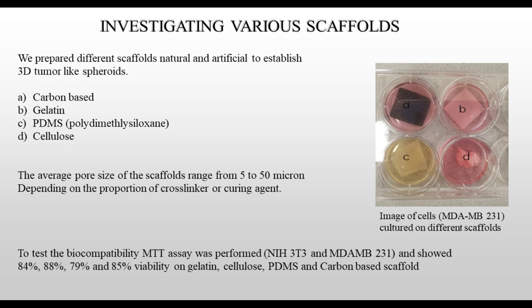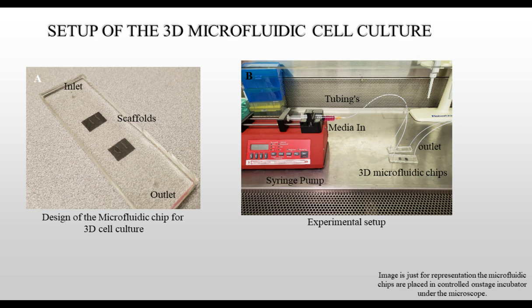I have incorporated an image of the scaffolds and preliminary studies we did using a 6-well plate assay, where we carried out different biocompatibility studies and also MTT assay. Initially we tested the biocompatibility, and it was found that these scaffolds are pretty biocompatible. We tested the studies on NIH and MDA-MB-231. Further, these scaffolds were incorporated into a microfluidic chip, which was designed in such a way that it would hold the scaffolds in the cell culture chamber.